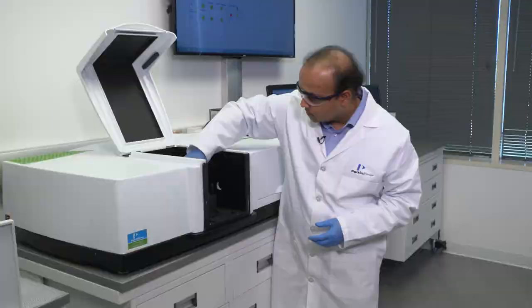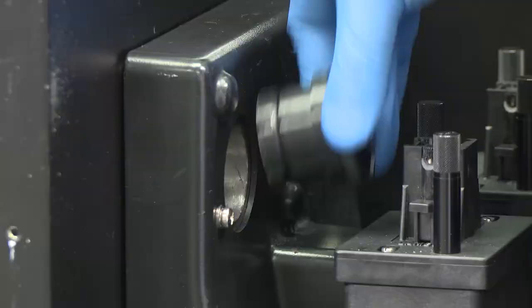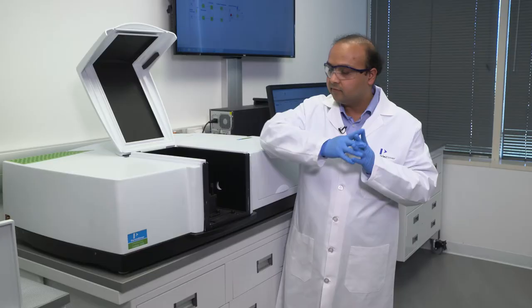We also have a polarizer drive in the sample compartment that will allow us to study the effect of polarization of optical materials. So here is a polarizer that can be mounted on the polarizer drive. It pretty much just goes in, snaps in place, there's a groove there.